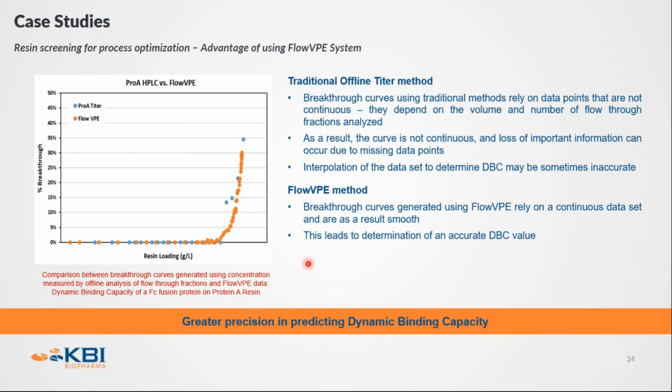Okay. So then a couple more utilitarian questions here. How long can a single fibrette be used? I know I can answer that, but I'd like to hear your thoughts. If it is handled correctly, it can be used for years and years together.